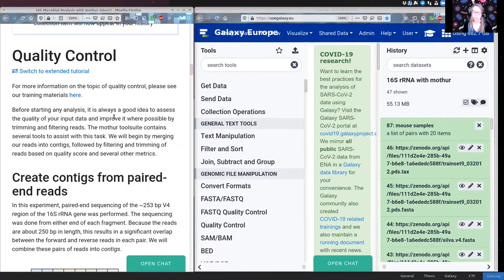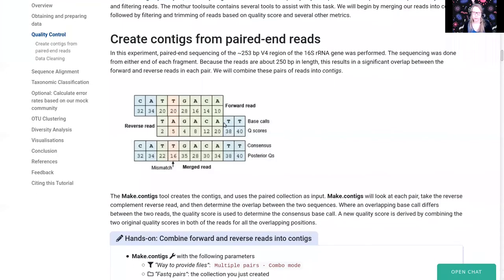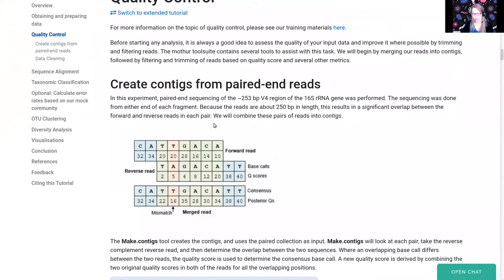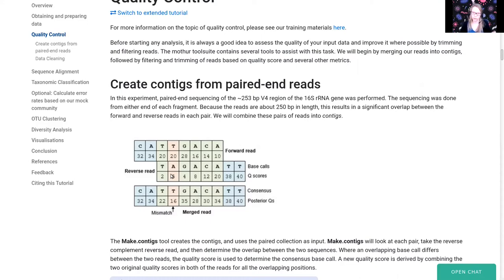The first step of quality control is to create contigs from our paired-end reads. We sequenced the V4 region of the 16S rRNA gene, which is approximately 253 base pairs long, using 250 bp paired-end reads. Since one read was sequenced from each direction across this 253 bp region, there will be a lot of overlap in the middle between the forward and reverse reads. We will find that overlap and use it to improve the quality of our sequences.